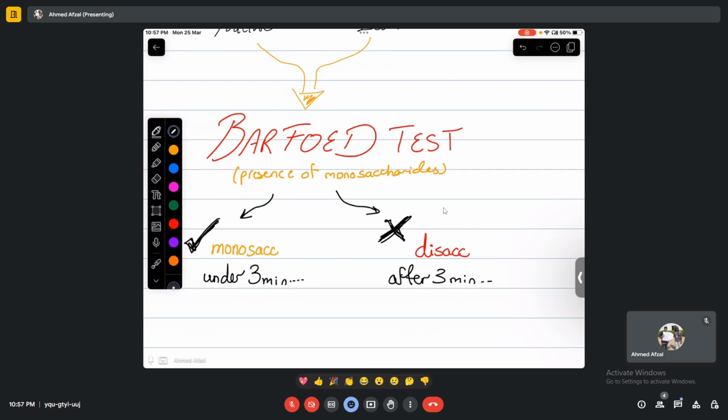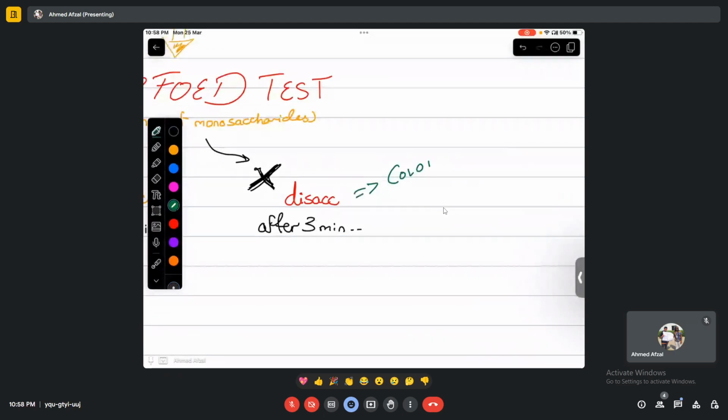There is another test that can be performed. It's called Osazone test, O-S-A-Z-O-N-E, Osazone test. So different colors would indicate exactly which disaccharide they might be.